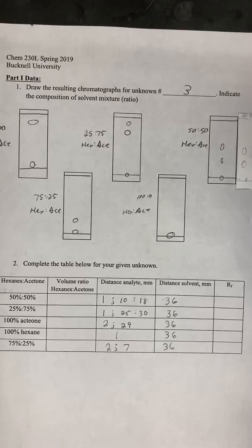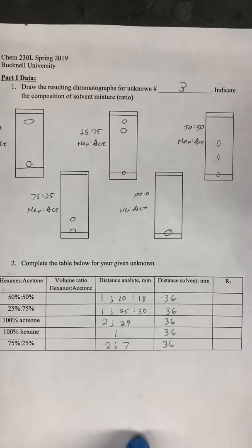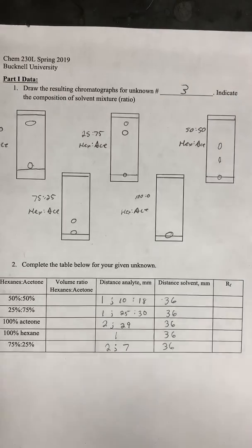So we see here we have our 50-50 hexane to acetone solvent ratio TLC plate, and then I just duplicated it on the handout itself. And so now what we want to do is measure the distance that the solvent traveled up the TLC plate.